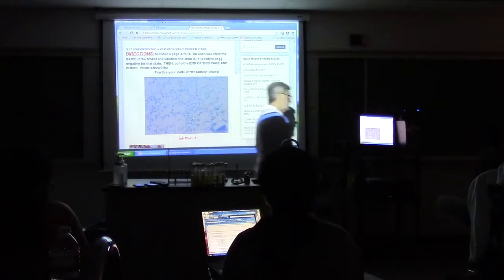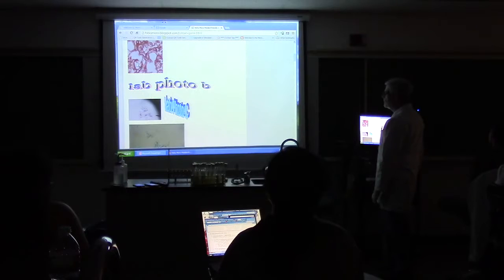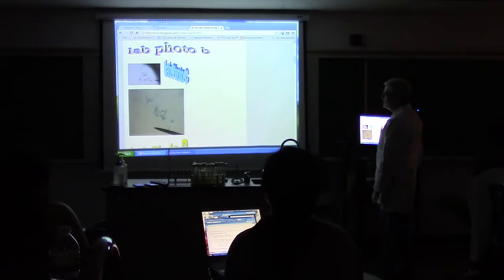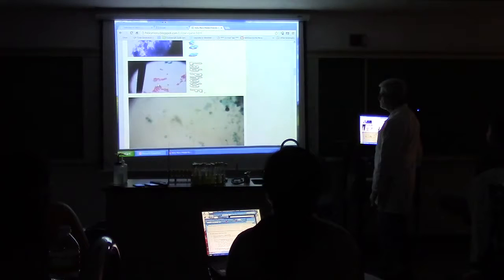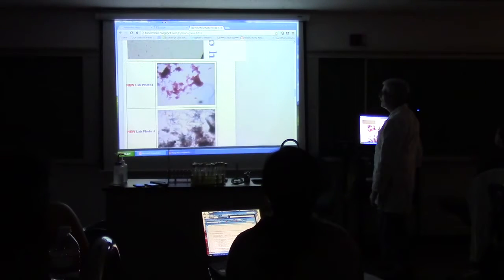All right, if you looked at the next one, that one would be pink, and there are little pieces of garbage green here, so this you know was endospore. Now this one is very hard to read here. I won't give you that harder one on the test. Let's go down to, there.